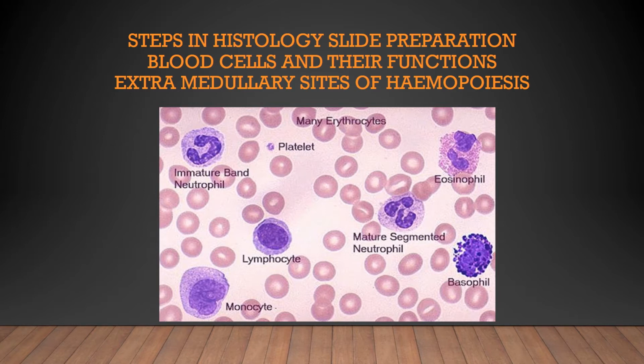Then you have basophils, which are larger than neutrophils and smaller than eosinophils, and they contain coarse purple granules, which vary in size and shape. Their granules contain histamine, which is the culprit in hypersensitivities. You have eosinophils, which are larger than neutrophils and basophils. They contain a bilobed nucleus, large red-orange granules of uniform size, and the granules contain major basic proteins, which are released to kill bacteria that's too large to phagocytose.